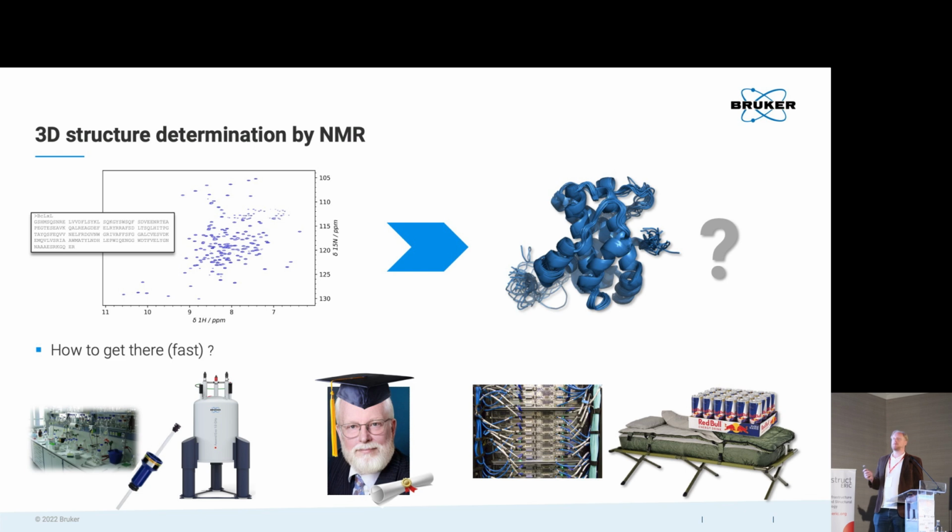And if you really want to push this, if you really want to get this done fast, well, the calculations involved, yes, you could do this on a regular workstation. However, if you go through multiple iterations and you're in a rush, then you're going to require some additional computational power in order to get this done faster. And as I said, if you really want to push it, you might need some help in one form or another. And also, the poor guy down there better have a couple of years of experience.